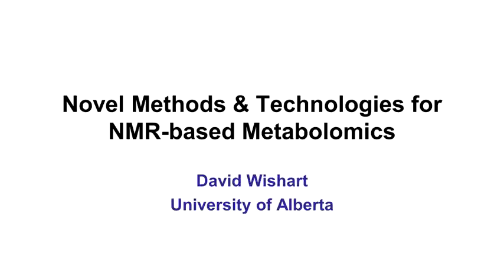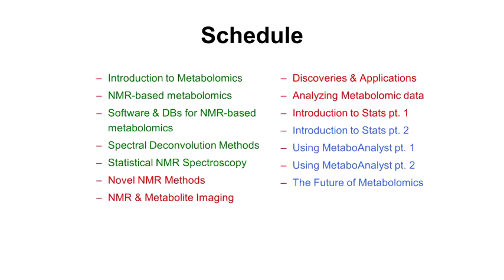Now moving to day 2, and we have 5 lectures that we'll be going through. The first one is on novel technologies and methods for NMR-based metabolomics. Yesterday we talked about some of the more conventional methods, the general protocol and workflow for NMR-based metabolomics. This time we're going to look at some of the newer ones. We're also going to talk about NMR and metabolite imaging after this, and then we'll discuss some of the discoveries and applications of NMR-based metabolomics.